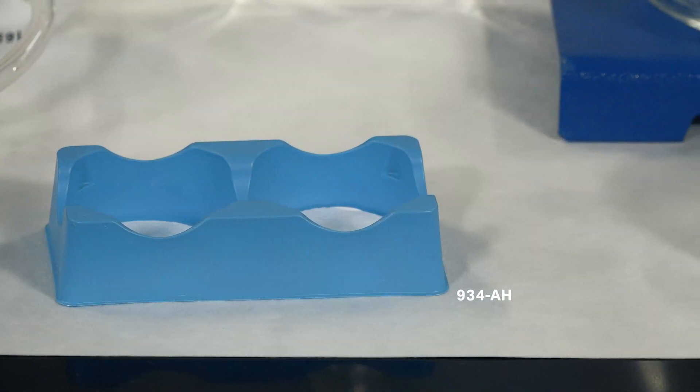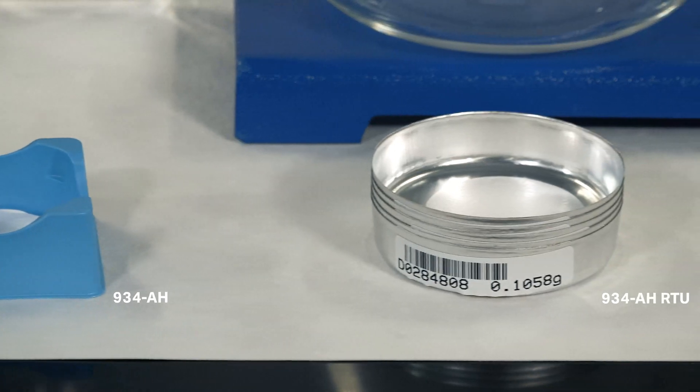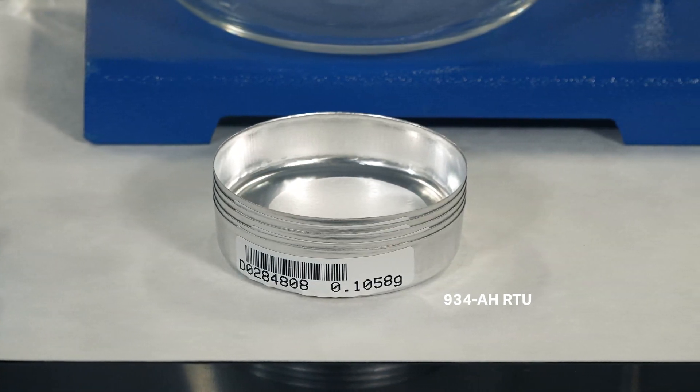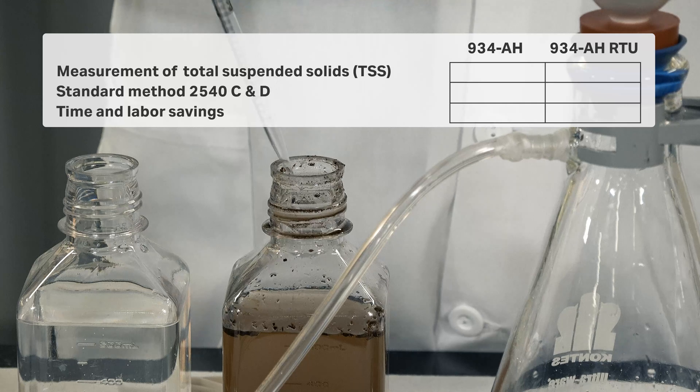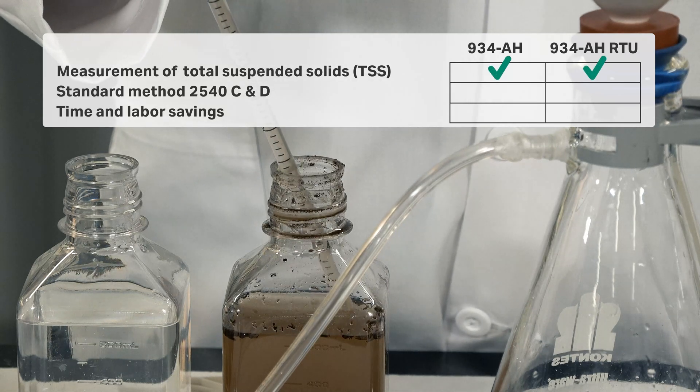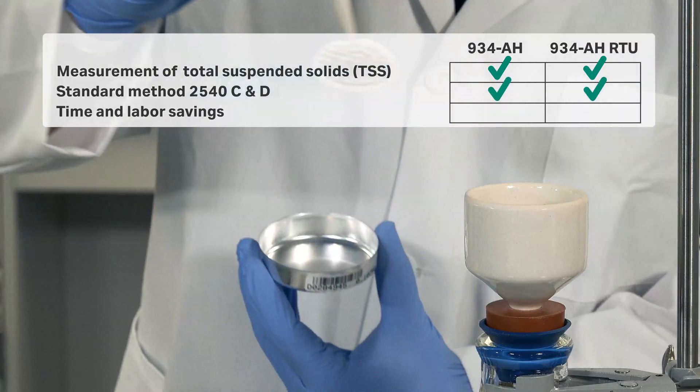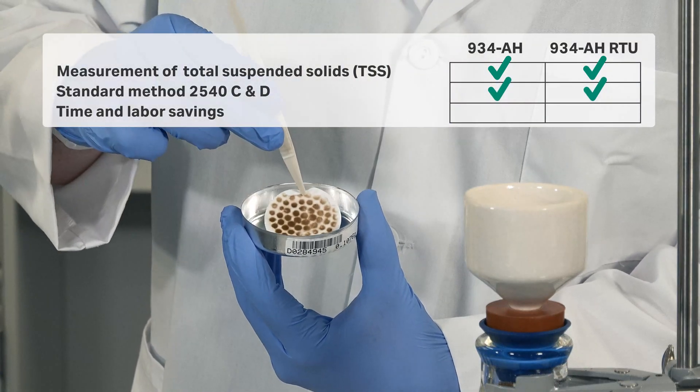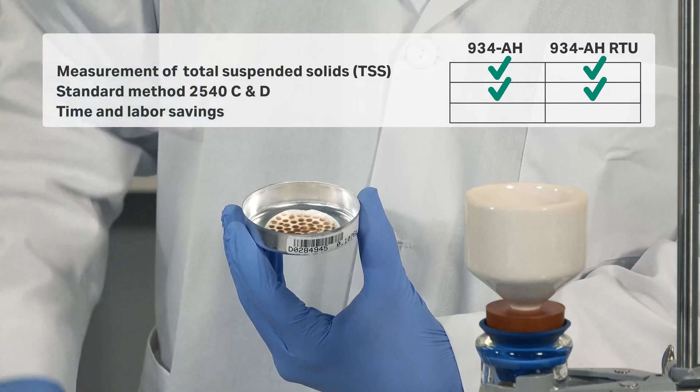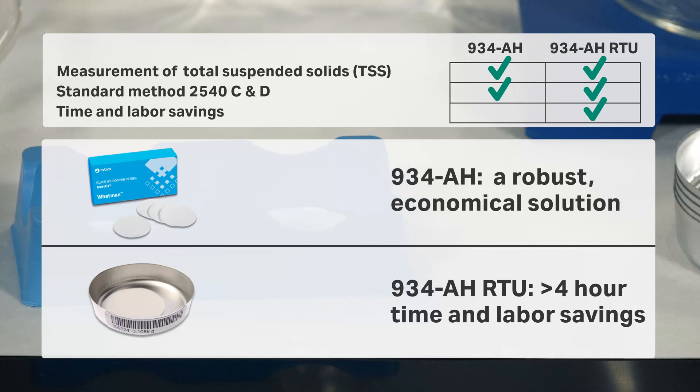Today, we will be showing the differences between 934AH and 934AHRTU. Both products will produce the same result: measurement of total suspended solids, TSS, in compliance with standard methods 2540C and D. However, the 934AHRTU will be a good alternative to save time and labor.